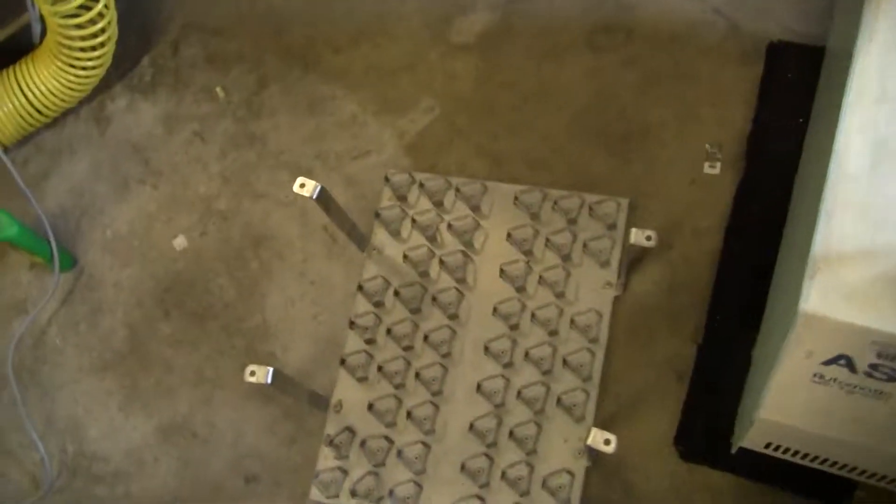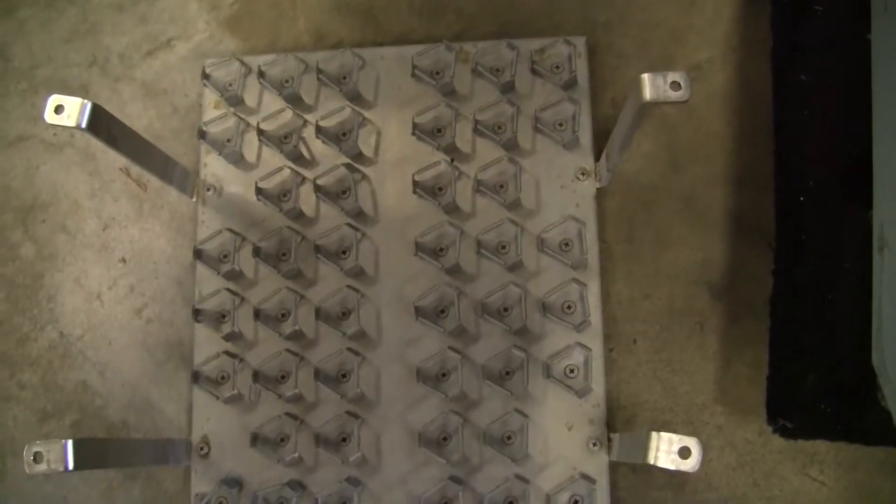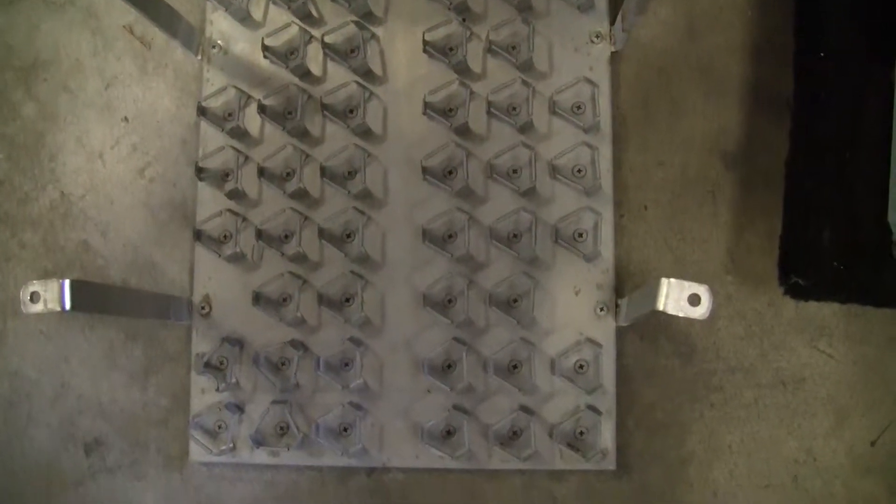As far as the trays, this is the tray that came with it. This is what I believe to be a standard tray set, a dedicated tray set.